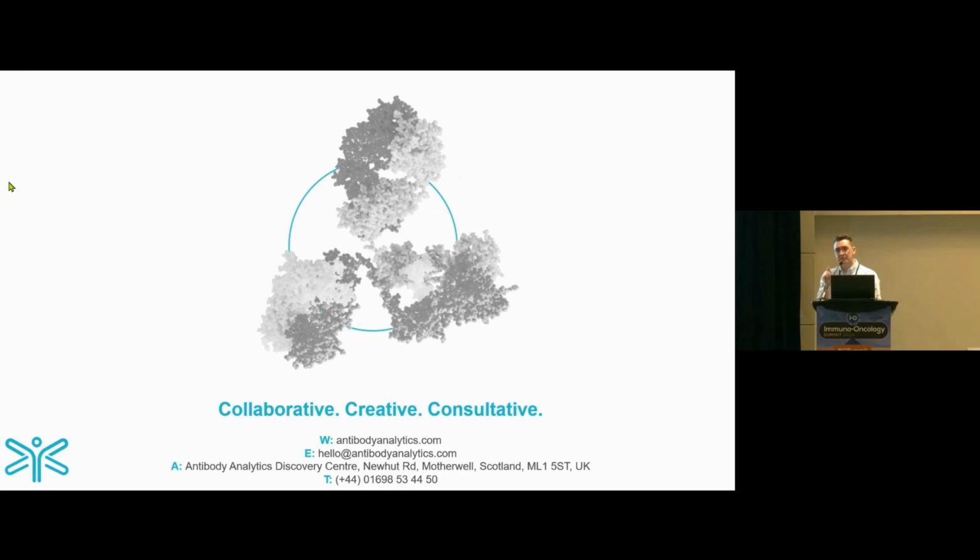About the stability of expression: because the auxin doesn't impact the immune cells, we can leave it in there, but it keeps going up. If we take it out, it depends on the target and the system you've used, but normally we see it maintained for 48 hours, and then you start to see a drop-off at that point. The assays that we run usually last 48 to 72 hours for the cytolysis as well.